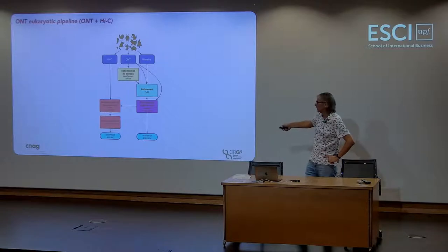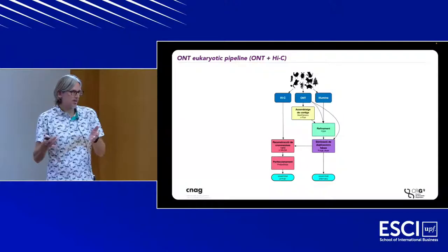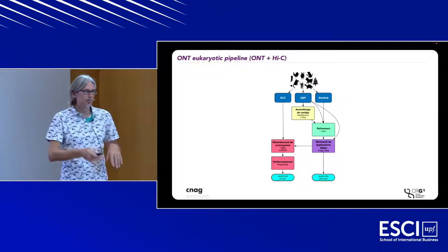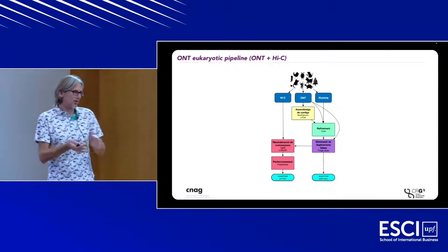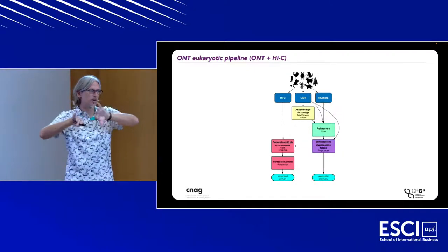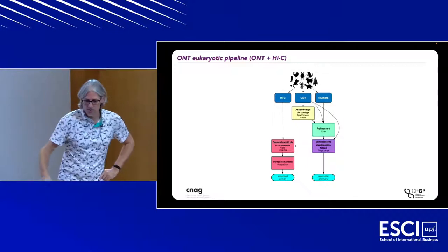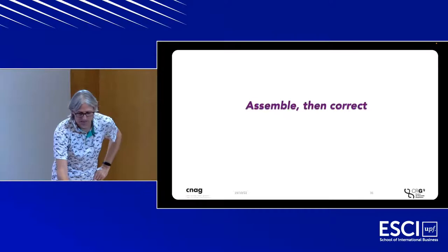After that, we eliminate any other problems, like haplotypes that we've accidentally included in our haploid genome assembly. Okay. Some people also try to produce diploid assemblies, in which case you want to keep all the haplotypes, but be able to separate them properly. Okay. And then scaffolding them into chromosomes, and then outputting and curating the assembly.